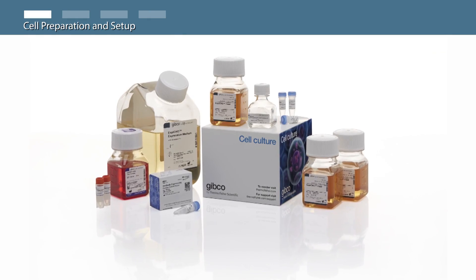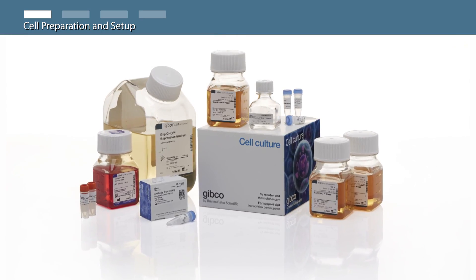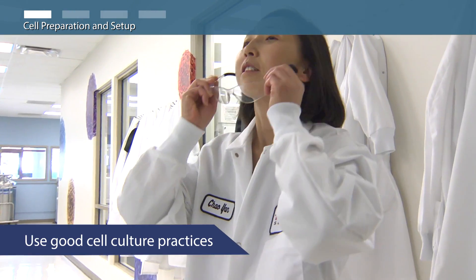In this video, you will learn how to produce recombinant proteins using the XBCHO expression system. As always, use good cell culture practices and wear your personal protective equipment.